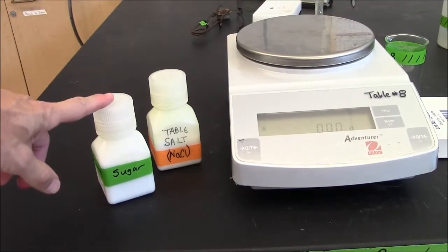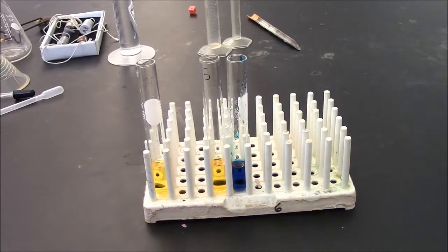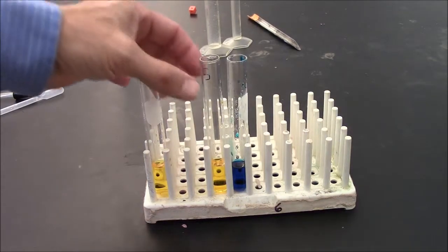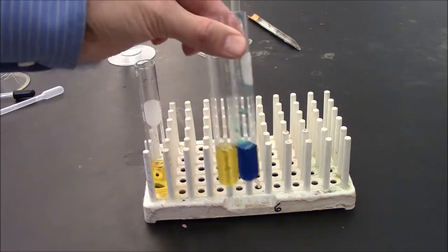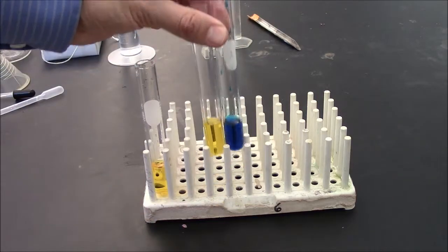Read the scale. You'll need sugar for part 2 of the lab, and you may need salt later on. These will be located next to the scales. Part 5 asks you to create a colorful layered effect. I have here liquids of different densities that I've created, and I've added food coloring.